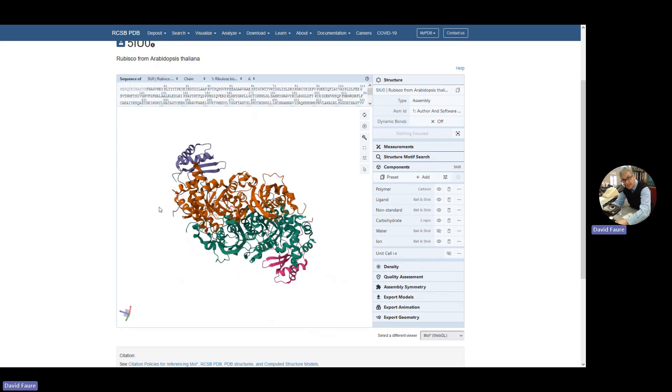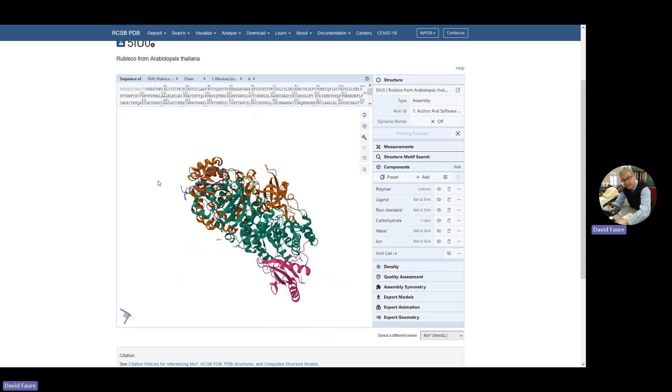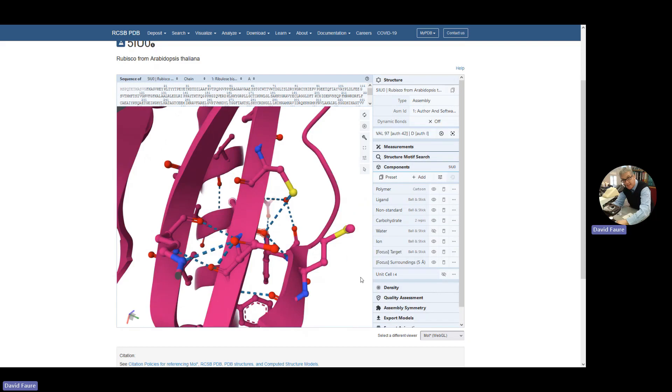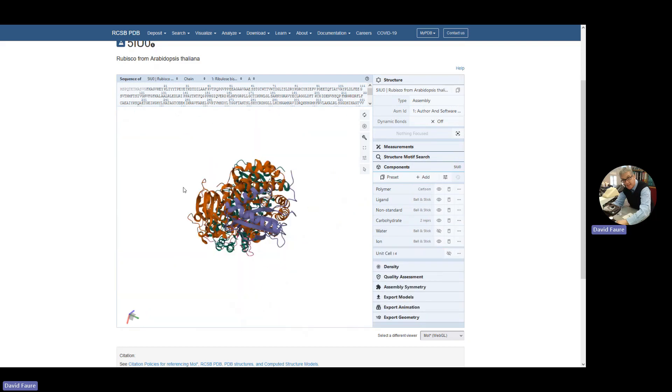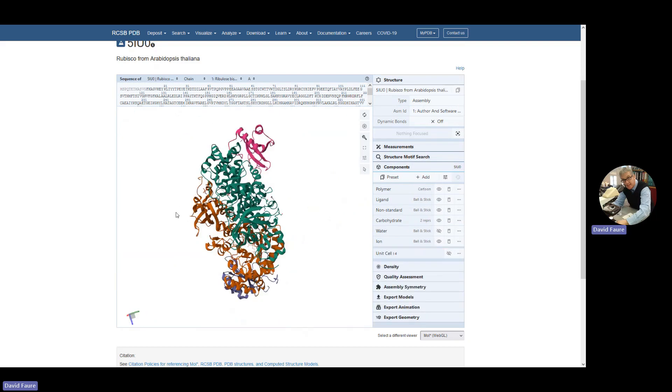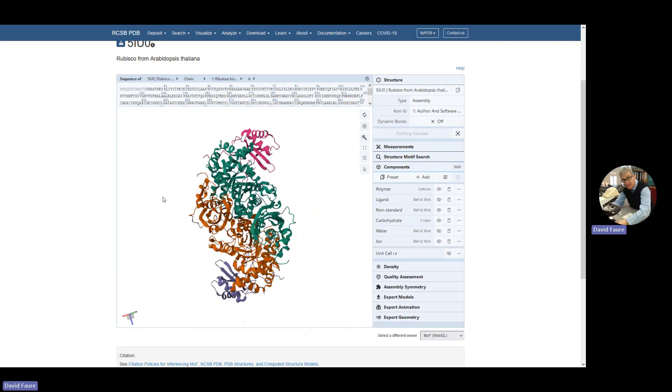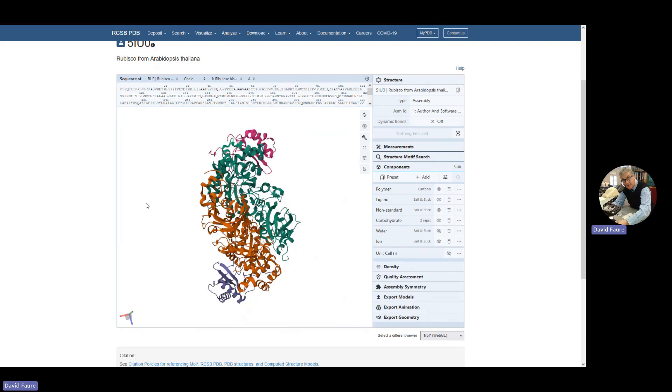If you want, you can look at something else. But it's a really nice way to visualize a protein. And this is Rubisco. It's a large soluble protein which binds to carbon dioxide. It helps in photosynthesis inside the chloroplasts and plants.